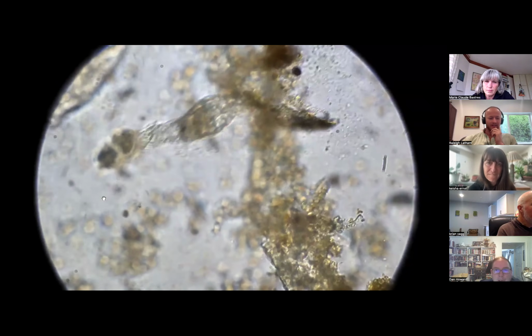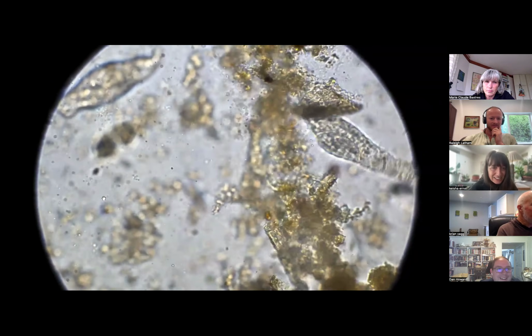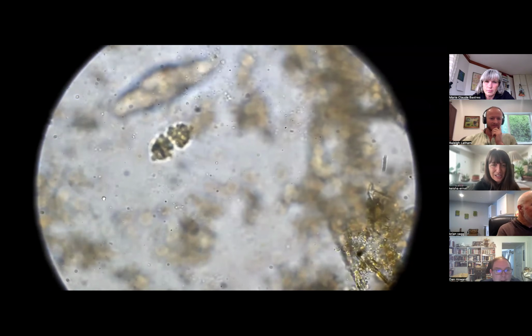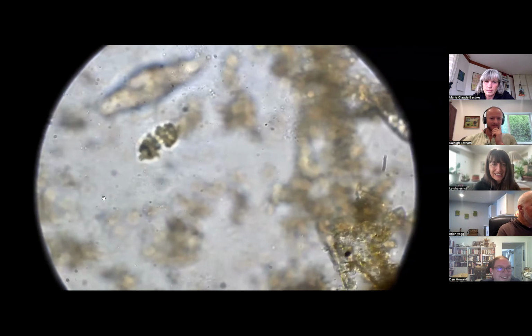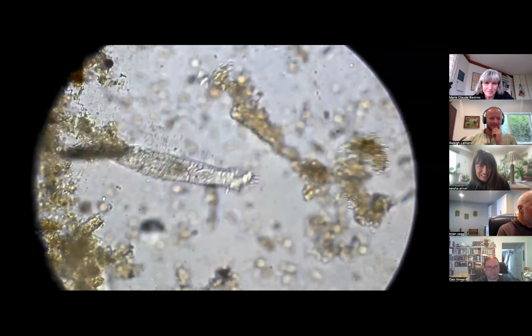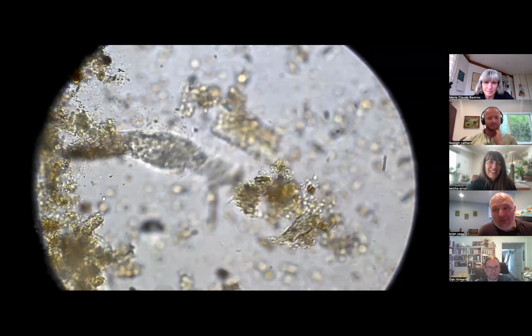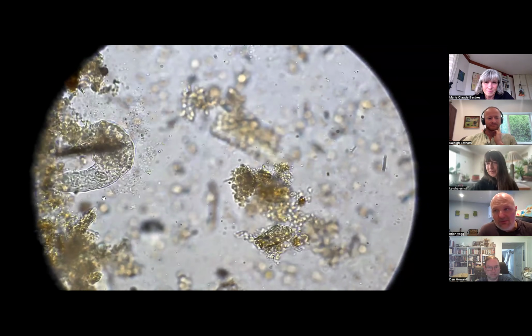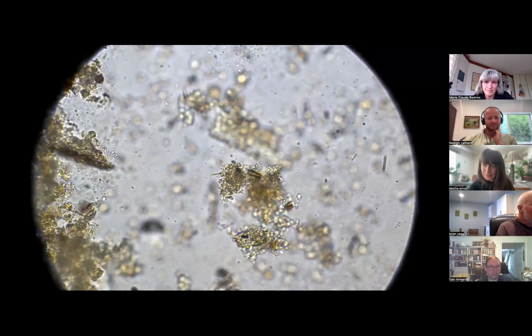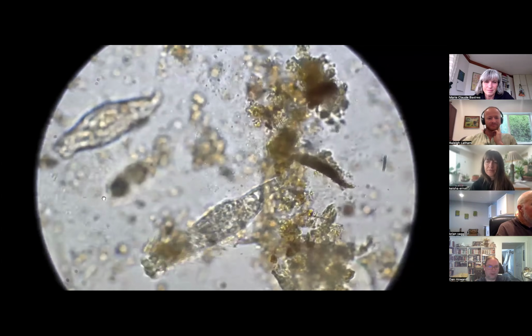There's almost like a flagellate that's getting pulled into the rotifer. I can't see. Oh, I see it. You see him right there? Yeah, he's like trying to escape. He's like, I'm getting out of here. But yeah, rotifers are just fascinating creatures to be able to observe. I have spent probably close to an hour sometimes just observing, watching, and they are just so much fun to see, and they can process so much bacteria.